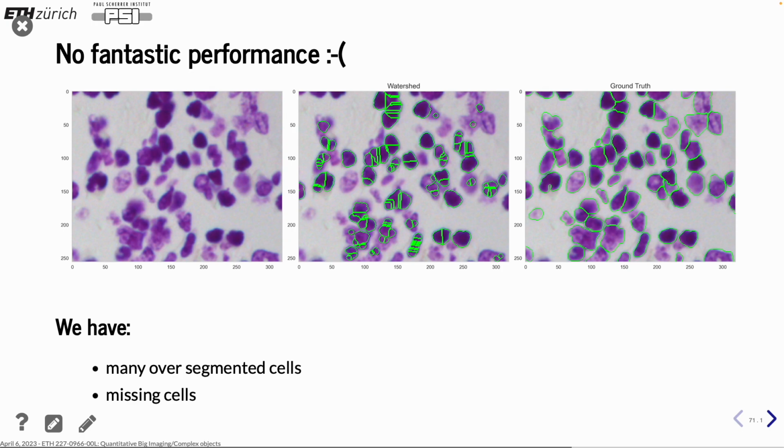Also with the skeleton, I think if you smooth the, so you may move relevant, these kind of modifications. On one side, you do something to remove an effect, but you may introduce something new. So that is something you have to be very careful when you design your analysis, that you don't introduce new things, invent effects.